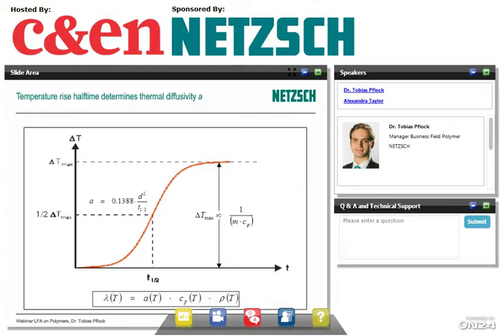So what do we get from this? If we look at such a curve in principle, as it's shown here, this is actually the simplest model that you can get, and the red line just shows the temperature increase at the detector. On the x-axis again we see the time, and what we now do is we just look at the half time that the signal takes to travel through the sample, and this correlates.